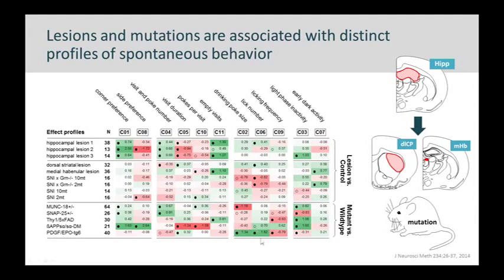And you see the changes here are mainly in the components that are related to licking frequency and licking. So this indicates that already during the very first week of testing in IntelliCage, when the animals are just adapting to the cage, we can already look at the spontaneous behavior and see whether the pattern of changes has some similarities to conditions we already know, either other mutations or brain lesions that we have tested in the cage, and this can give us hints on how to proceed with testing on these animals, which further may be more complex and time-consuming testing batteries we can implement here.